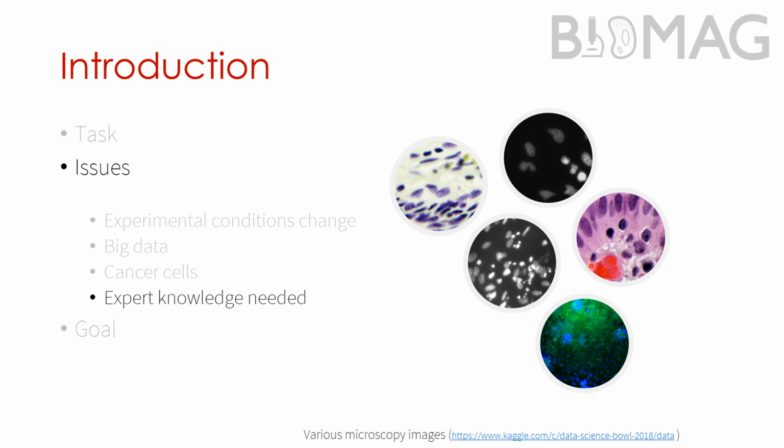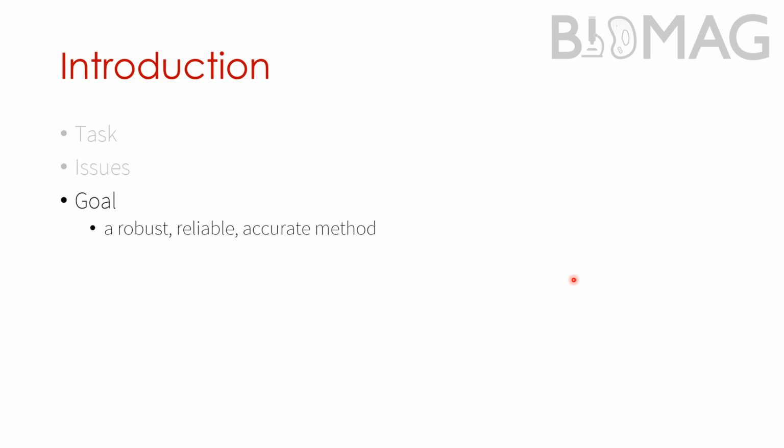Fluorescent images might be stained red, so it might be difficult for them to identify them as non-nuclei objects, and also in the middle example, these smaller objects here might be actually artifacts that also shouldn't be identified as nuclei, but we need the experts to teach the model, teach us what is an object and what is not, and this expert knowledge is expensive and time-consuming.